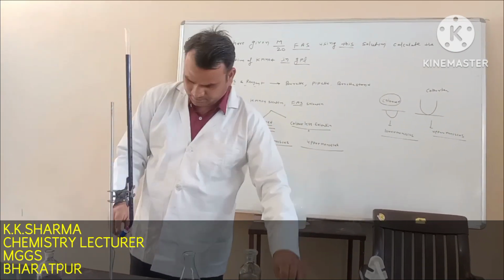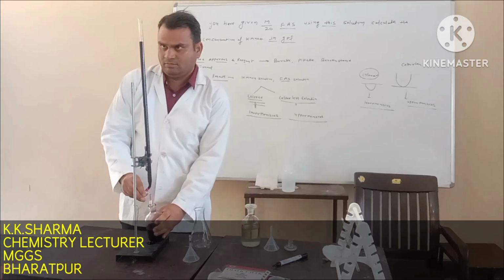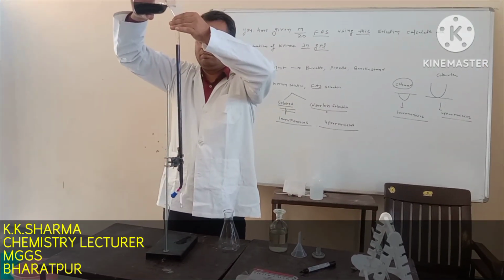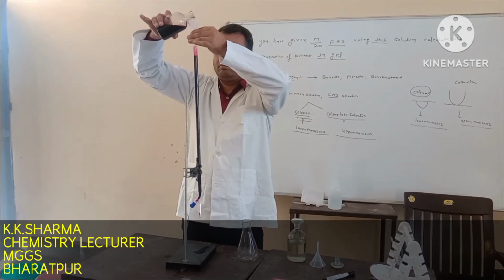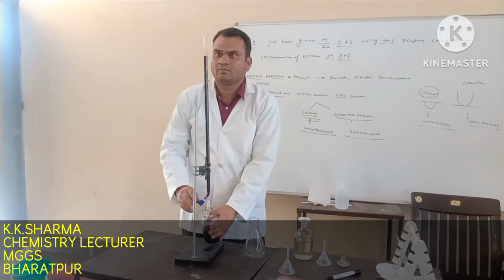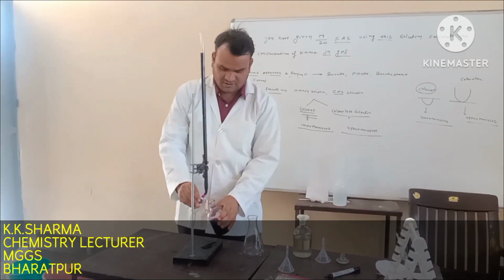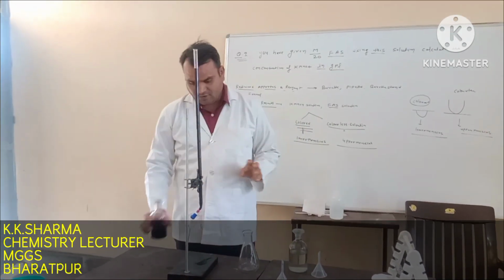Look, this is the lower meniscus because the solution is colored KMnO4.